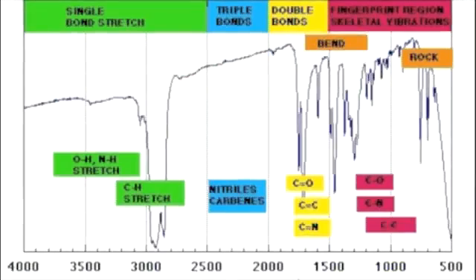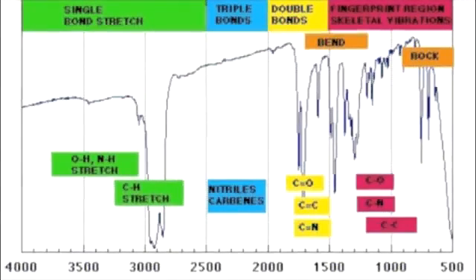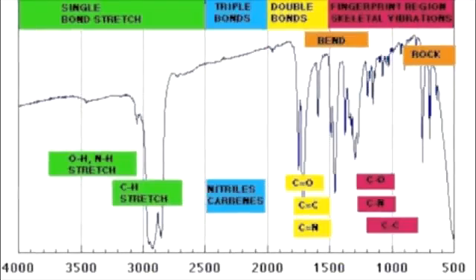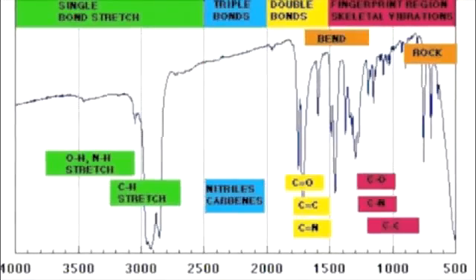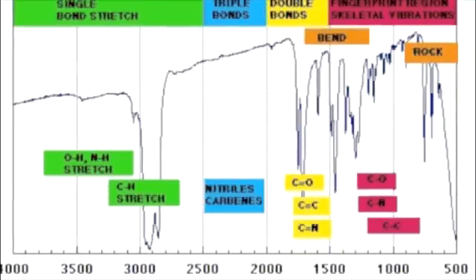So today I'd like to talk to you about IR spectroscopy and about how to read those spectra. Before we get started, here's a schematic of what types of things absorb in what areas. For example, at 3000 you can see the C to H stretch. At 1700, of course, there's the very strong and famous carbonyl absorption.